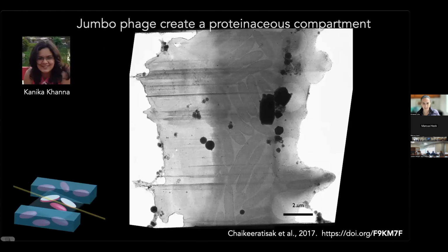All right, so Kanika, who's amazing, figured out how to make a monolayer of bacteria in order to be able to make this lamella, which for some reason that I don't have time to talk about is very tricky. So she managed to infect these bacteria, put them on a grid, and then take a look at them. And the advantage here is that in a bacterium, you actually catch about a third of the cell and 20 different cells. It's easier to do better statistics about this stuff.